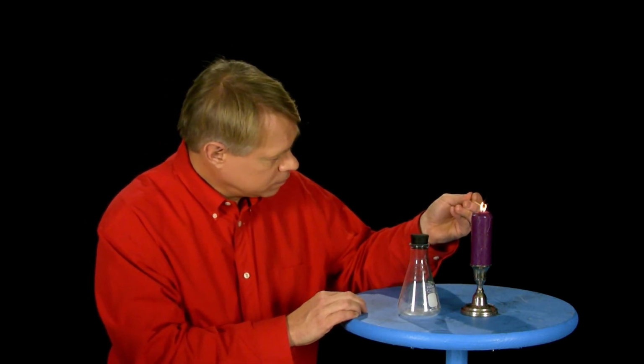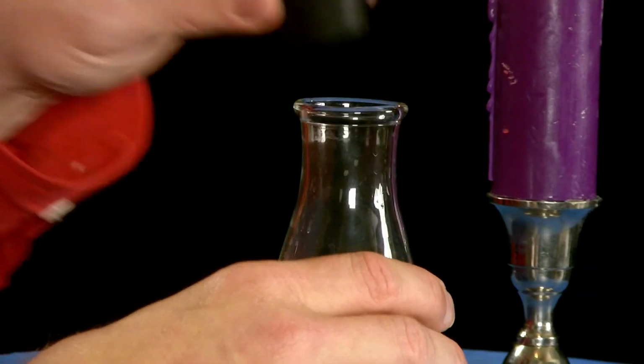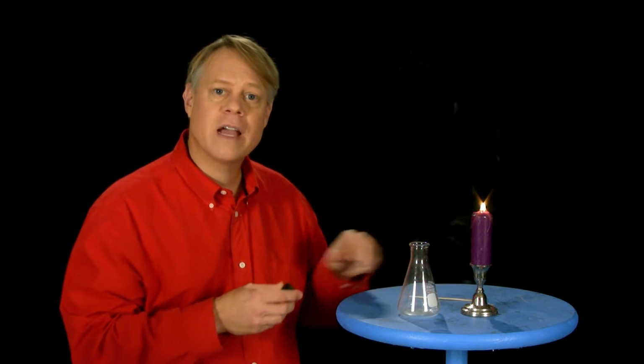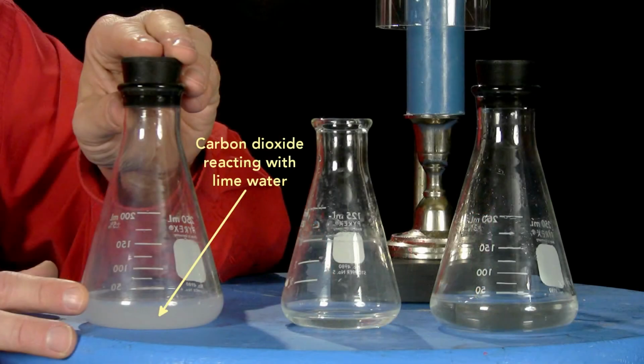What is its nature? Here is a vessel full of carbon dioxide, and we will try it, as we have done in so many other gases, by combustion. You see, it is not combustible, nor does it support combustion. Neither, as we know, does it dissolve much in water, because we collect it over water very easily. Then you know that it has an effect and becomes white in contact with lime water. And when it does become white in that way, it becomes one of the constituents to make carbonate of lime or limestone. It is a very weighty gas. It is heavier than the atmosphere.